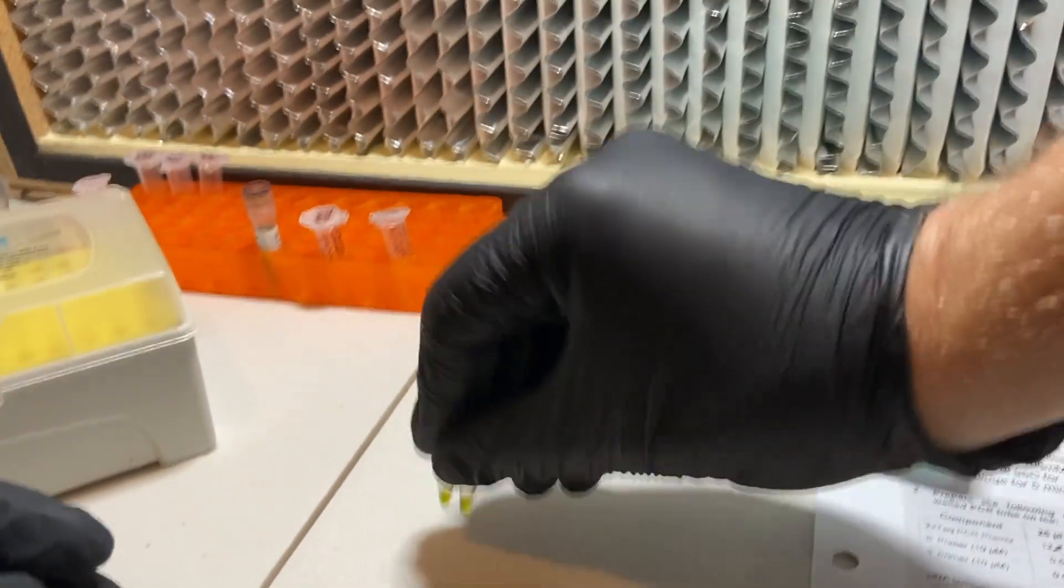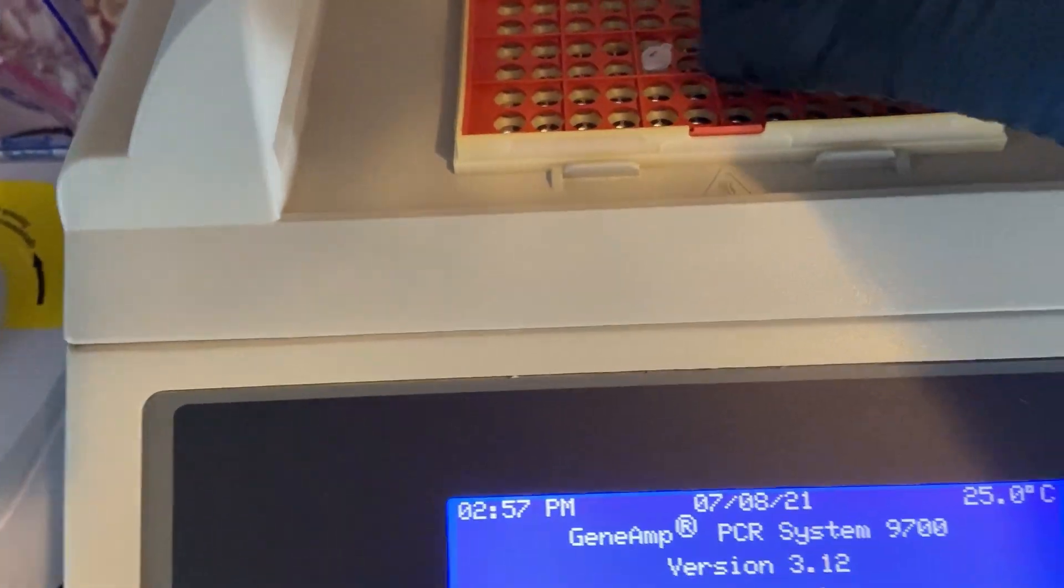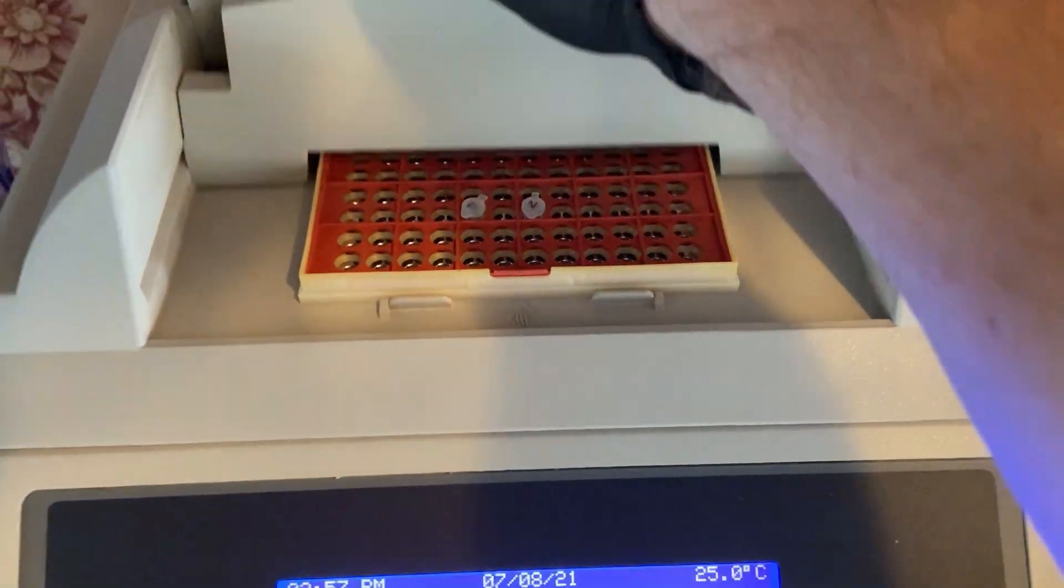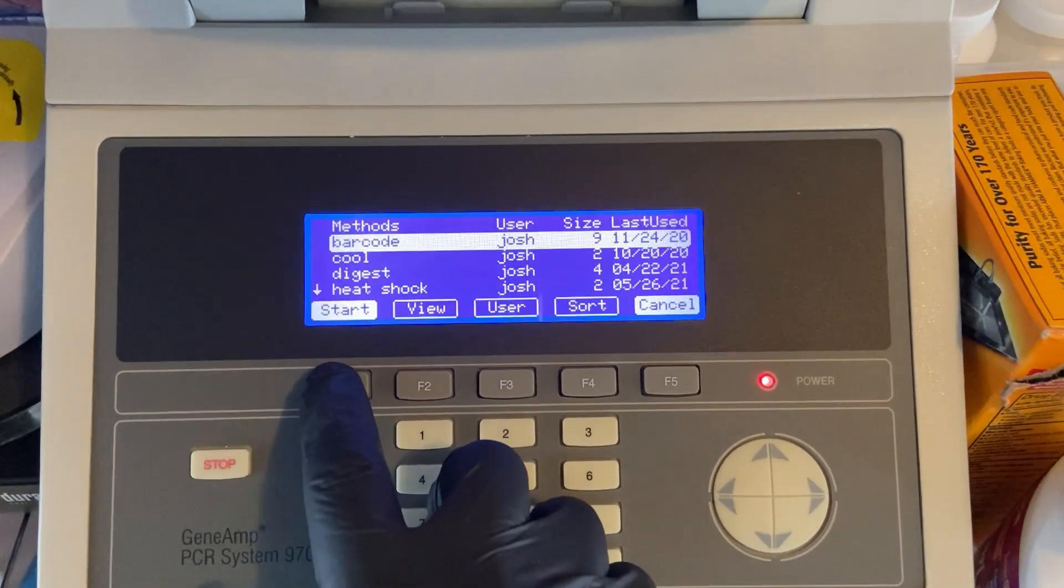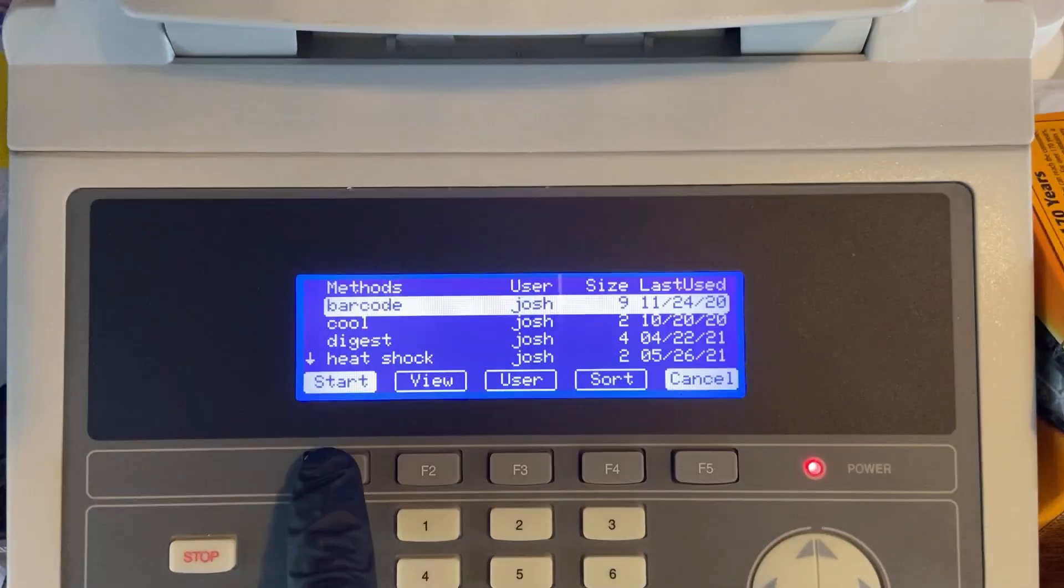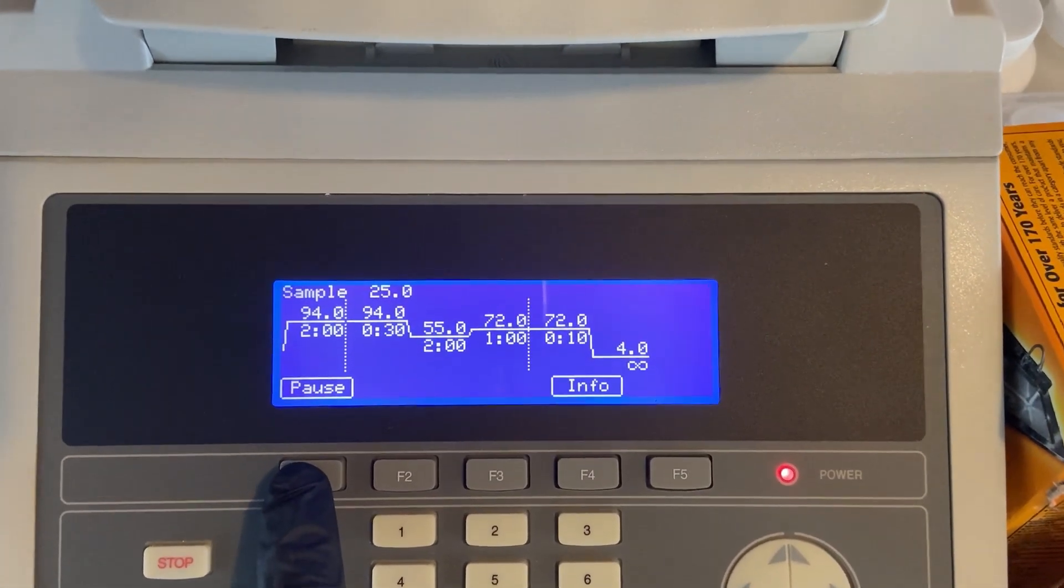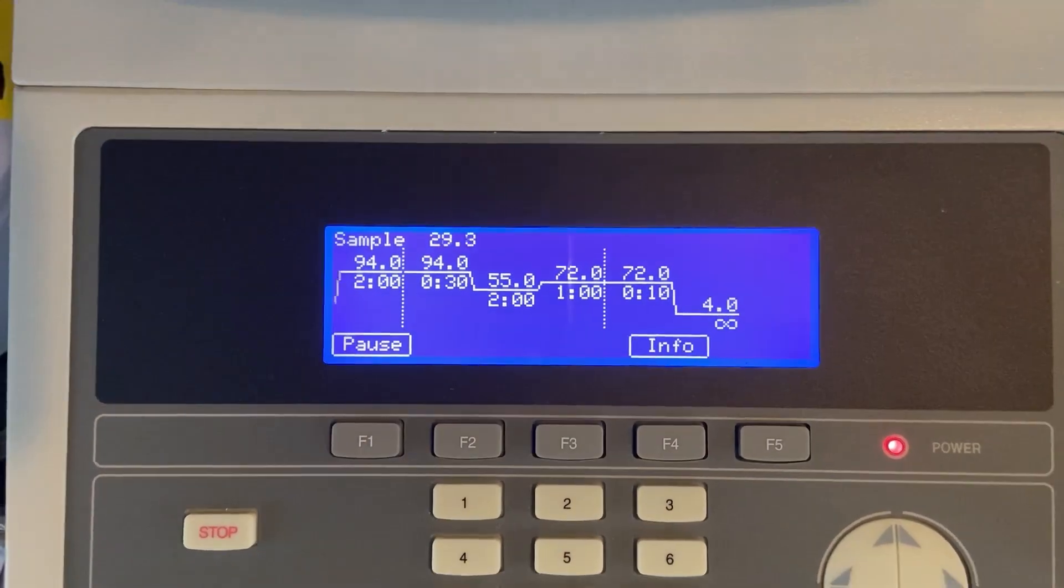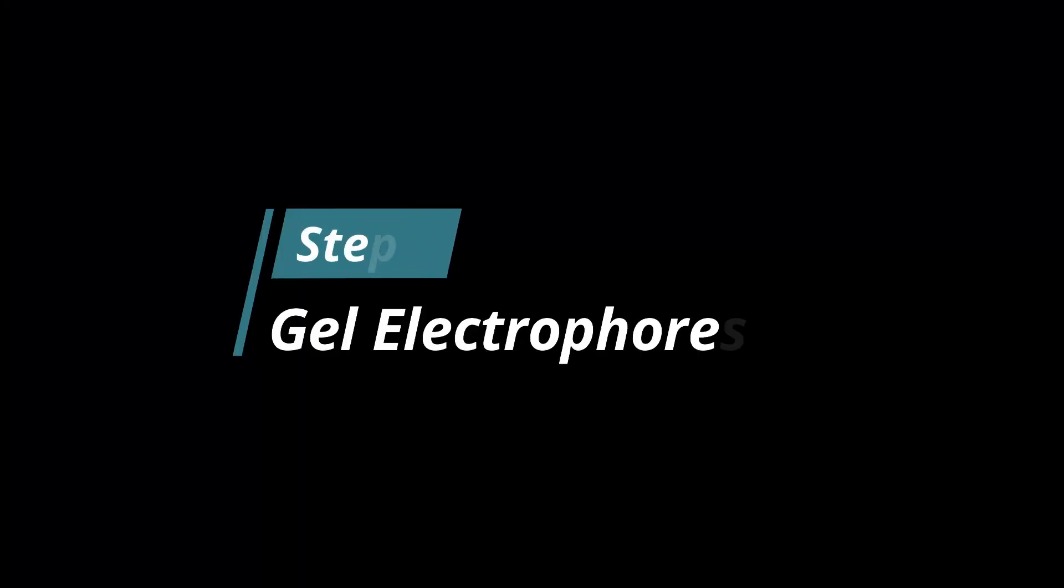And after we've prepared the PCR reaction tubes with our template DNA, we need to mix them really well. Sometimes I like to put them in the centrifuge for a quick spin. And then we'll put them in our thermocycler, where I have pre-programmed this thermocycler to run a particular program. It is a 25 microliter reaction, the lid's going to heat up, but here you could see all of the different cycles that will be run as part of this PCR reaction. And so I'm going to walk away and let it run, it takes about three and a half hours, and then in the final step here, we are going to now do the gel electrophoresis step.